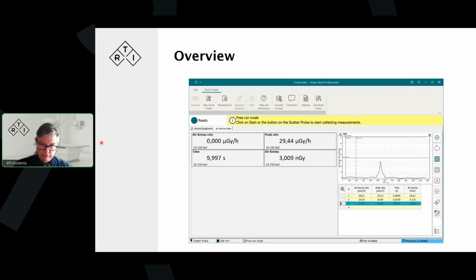So we need to focus on what we want and what we are looking at. The peaks? If you are, then you need an instrument with really quick response times. If you have an instrument which is slow, then you're not looking at the peaks, because it cannot detect those quick events. It has a slow response time. We illustrated it before. It takes time for it to respond.